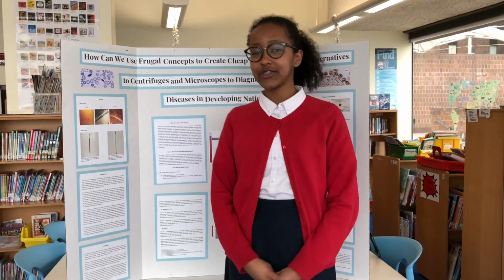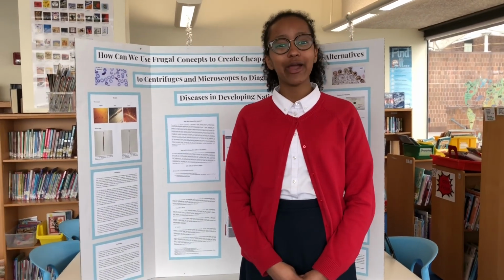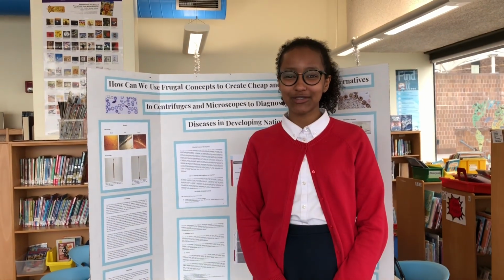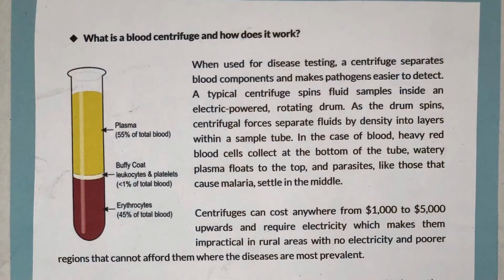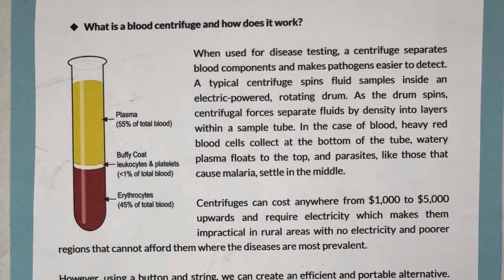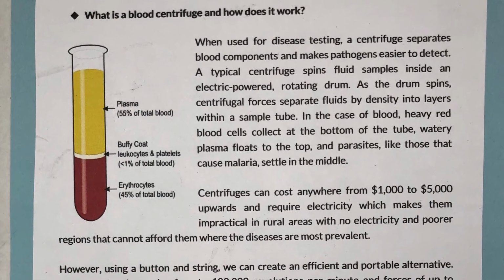I conducted a project on how we can create cheap and hand-powered alternatives to centrifuges and microscopes to help diagnose bloodborne diseases in developing nations. When used for disease testing, a centrifuge separates blood components and makes pathogens easier to detect.